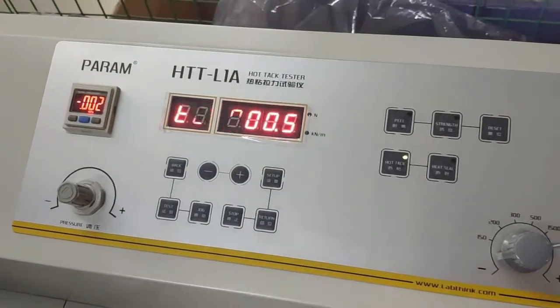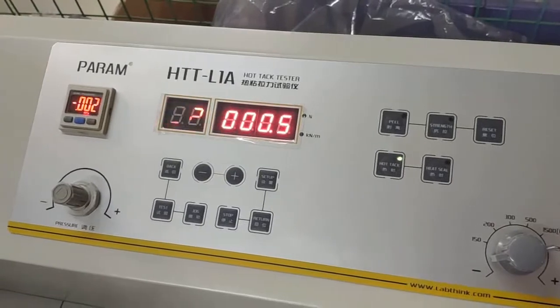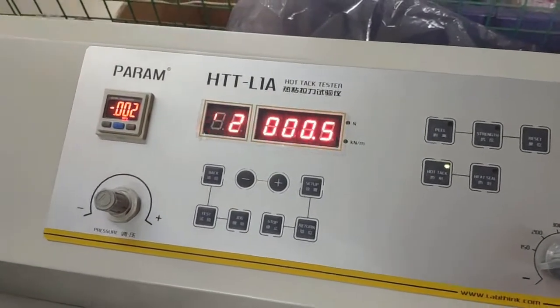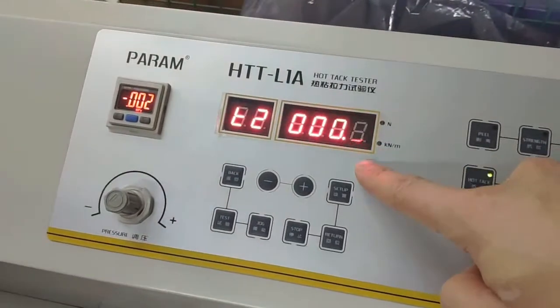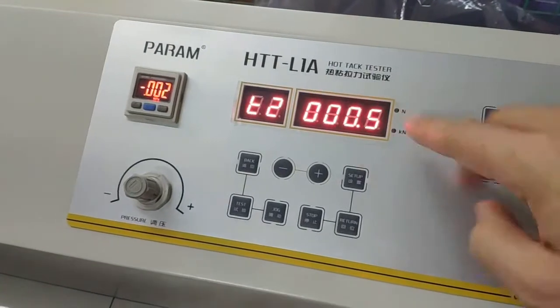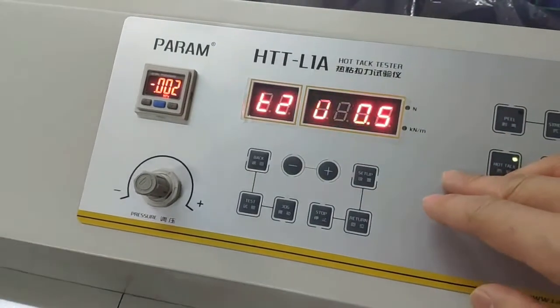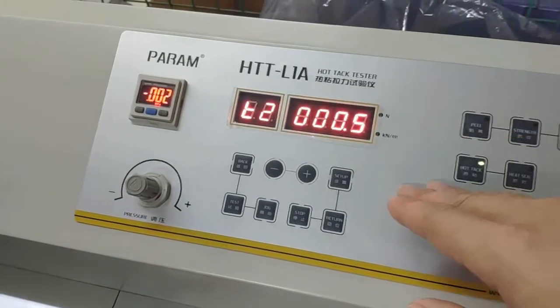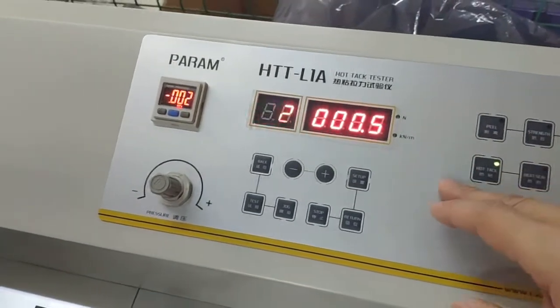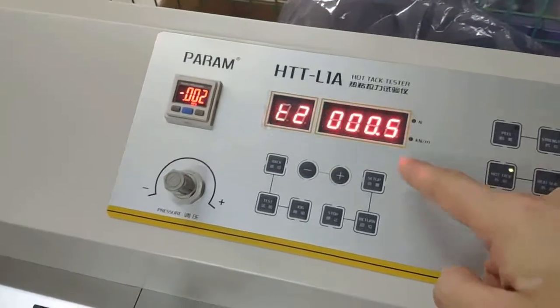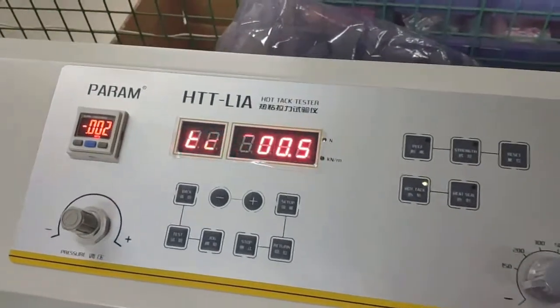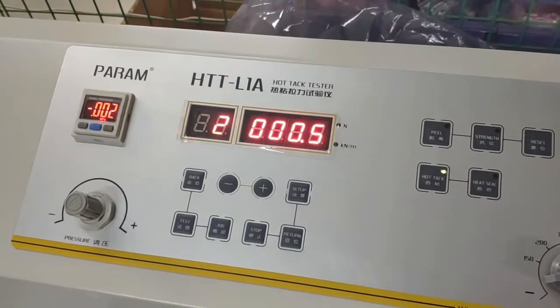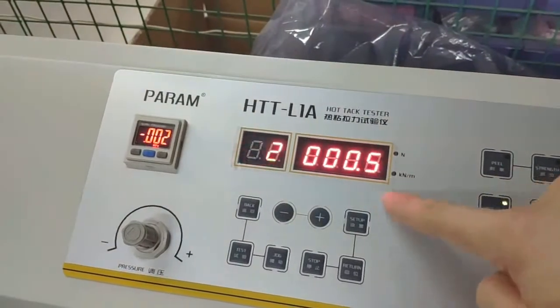T1 to T6 are for different sections of the time setup. You just need to know T2 and T3. For the other time values you don't have to change them, just set as the default value. T2 means the heat seal or hot tack seal time.